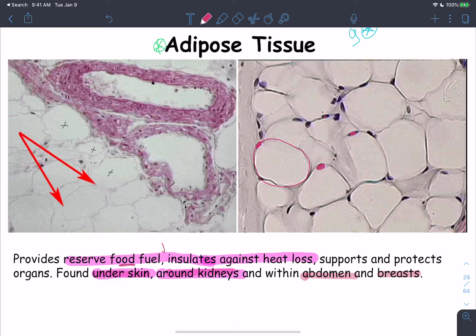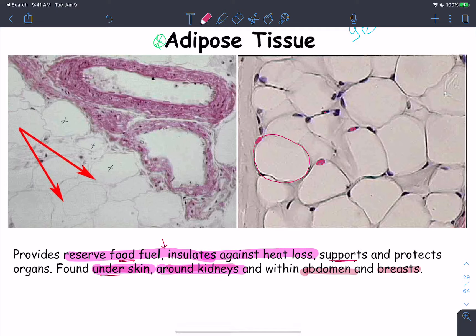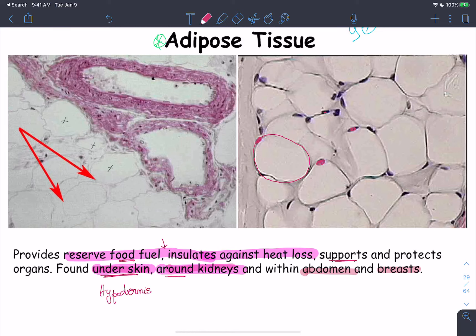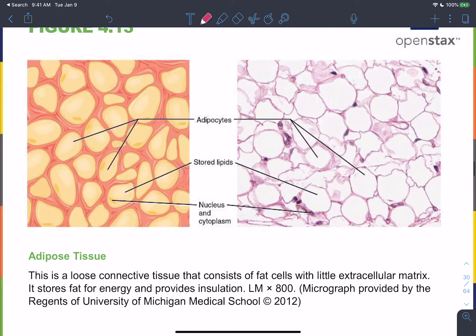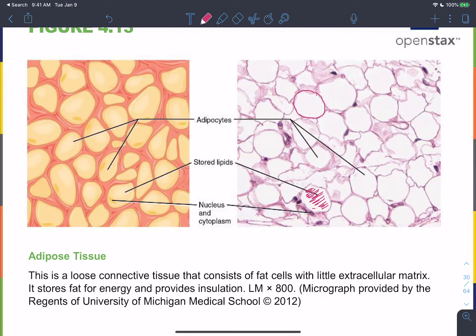Adipose tissue also insulates the body against heat loss, preserves body heat, and provides support and protection to organs. It is widely distributed under the skin in the hypodermis, around the kidneys, other abdominal organs, and in the breast. Slides show adipocytes with large vacuoles previously occupied by stored fat.